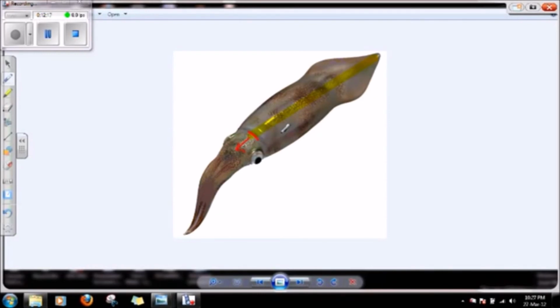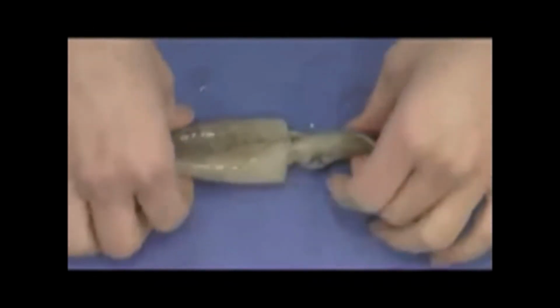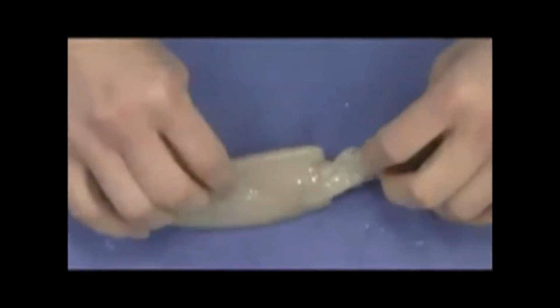Then, for an added bonus, if you'd like to, you can use the pen. If your ink sac is still intact, dip the pen of the squid into the ink and write your name on your dissection paper. For the final part of this dissection guide, I want to show you a video I found on TeachTube.